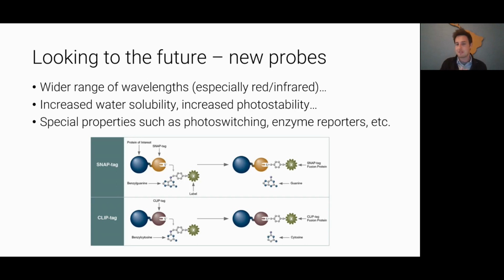And we're getting a really new, exciting series of fluorescent reporters coming into mainstream use, what we call SNAP-tags or CLIP-tags. These have all the benefits of genetic reporting, genetic encoding, but with small molecules rather than large and bulky proteins. So watch this space.